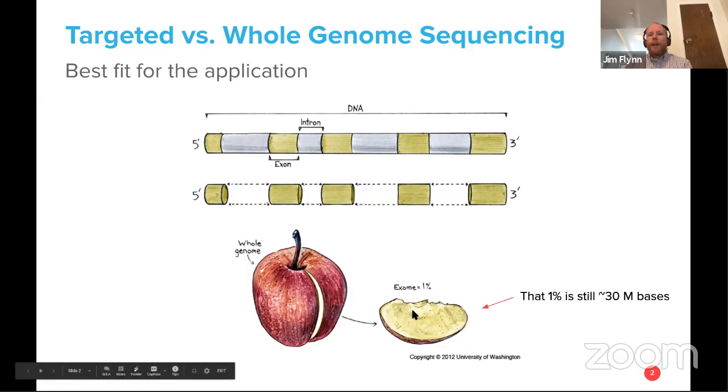If there's copy number changes or single nucleotide variants, which would encode for a protein change, which has a functional effect on that cell. It's also important to note that even though that's about 1% or a few percent of the genome, it's still about 30 million bases. So it's a pretty heavy sequencing requirement to think about if you ever wanted to translate this to single cell.